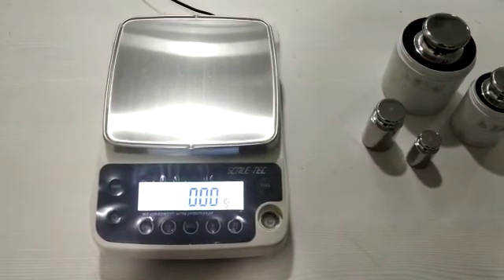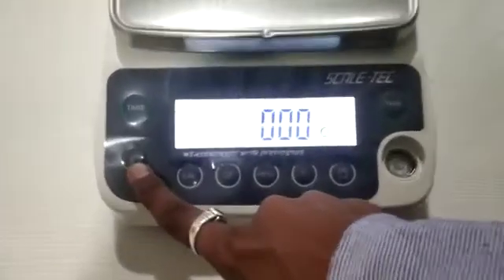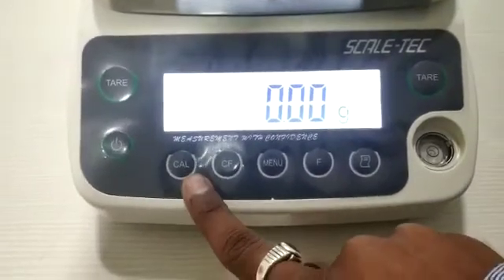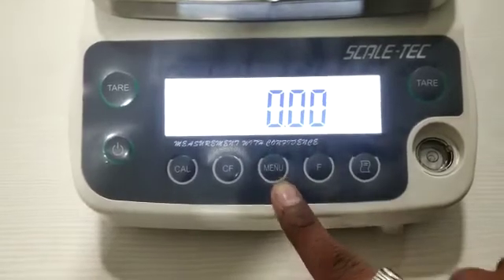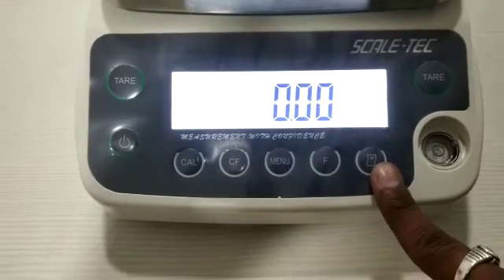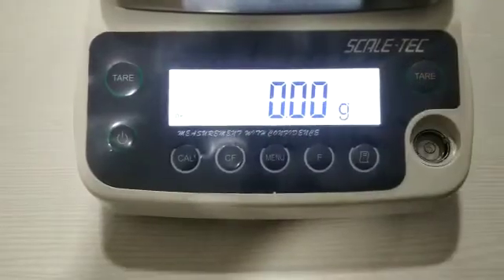Now let us identify what switches are available on the balance. First you will get the on/off switch on the left side, then the CAL switch, then the CF switch, after that the menu switch, then the F switch, and at the end the print switch. On top of both sides you will also get the tare switch.